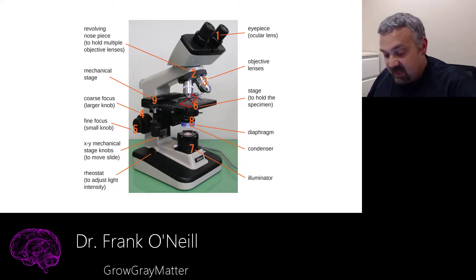And nine is the actual physical stage there that holds the slide. And that's what you move up and down, side to side, and forward and back to position your specimen so that it can be used properly.